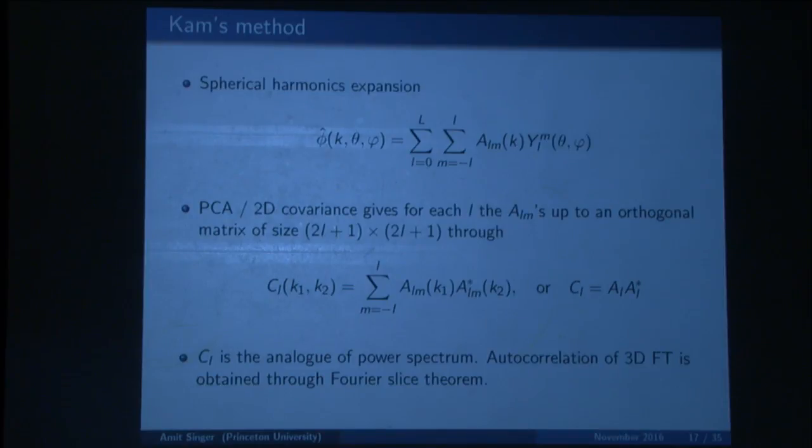let's do it in the 3D Fourier space. So pick two frequencies, say K1 and K2, that you want to correlate between them. Okay? So there is going to be an image that goes through those two frequencies together with the origin. And now, just look at exactly those two frequencies in the image plane in all the other images.